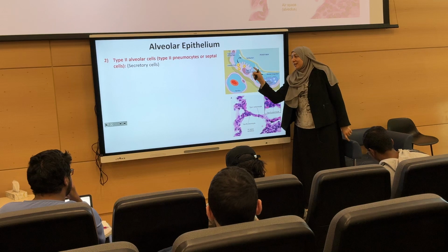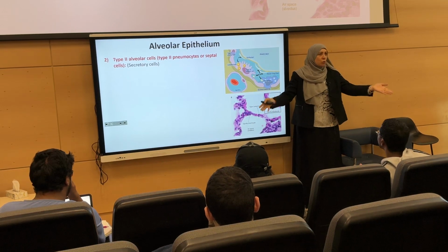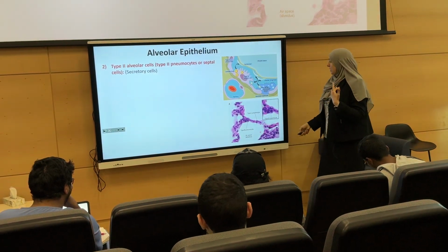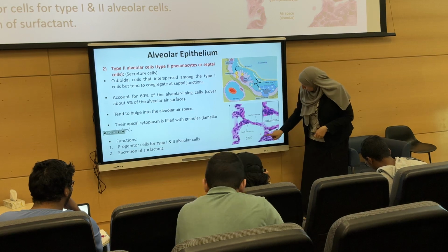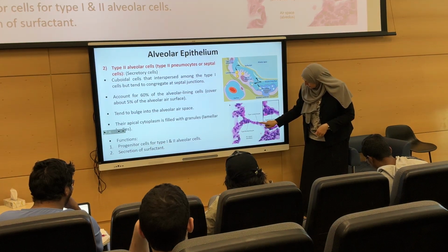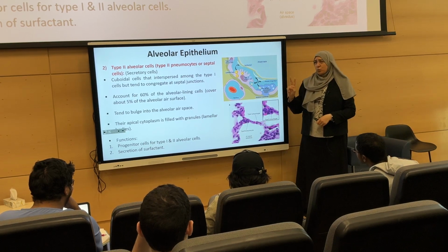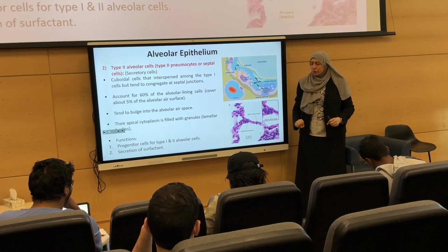And how will this cell attach to the pneumocyte type 1? It's the same. It's occluding. I didn't write it here, but it's mentioned there. You should understand this. Where can I find it? So simply, if you look here, what is this? Is this type 1 or 2? It's flat. The type 2 is a cuboidal cell, so it's a little bit protruding and has a rounded nucleus.